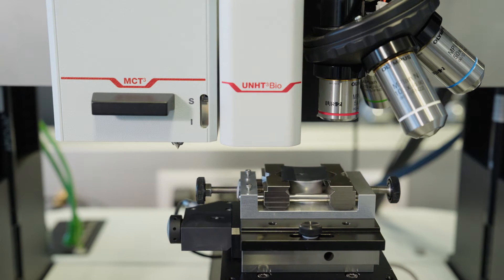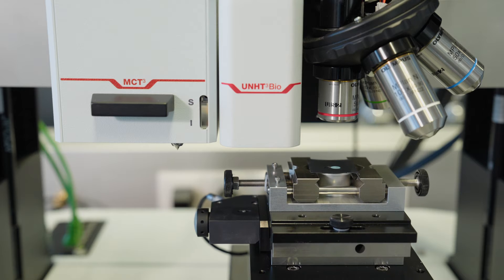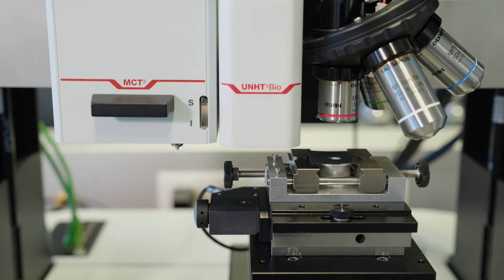Generally, the higher the critical load, the better the adhesion of the coating or layer to the substrate. It is much better to use scratch measurement platforms equipped with a microscope, as this allows optical analysis of the scratch and easy determination of the critical load. In this example, an 85 micrometer thick LFP cathode is being scratched with a special wedge blade diamond tip. The wedge blade is used on electrode coatings because it generates a sudden delamination of the rather soft coating, and the critical load is therefore determined very easily even by a non-experienced user.